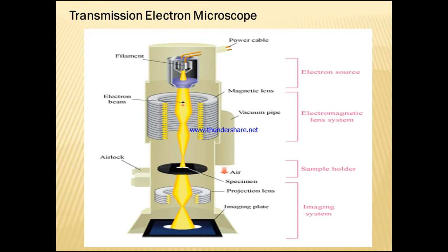I have some animated videos showing how exactly the transmission electron microscope works. So we'll go through that here.